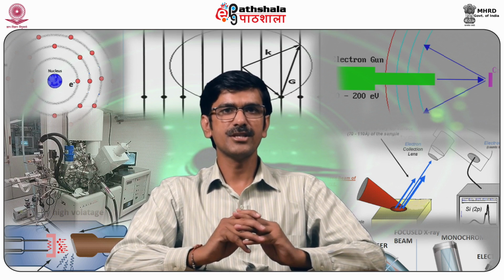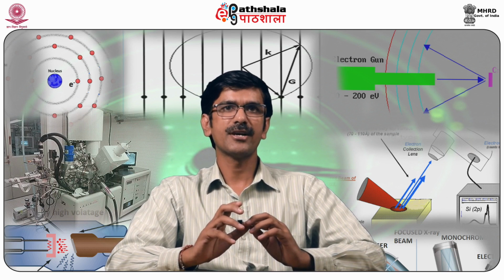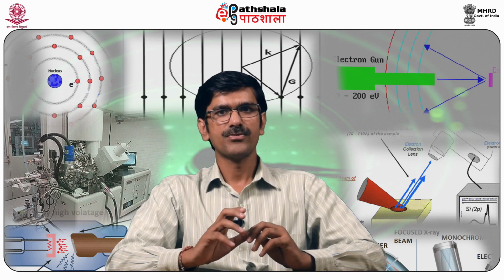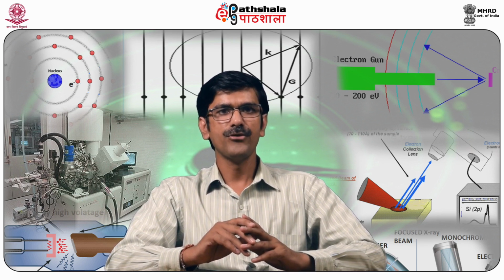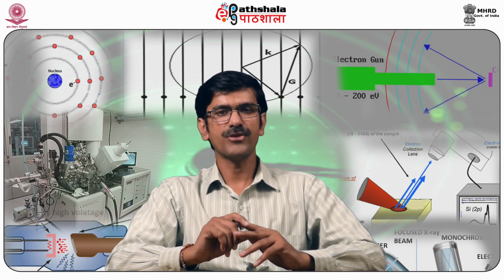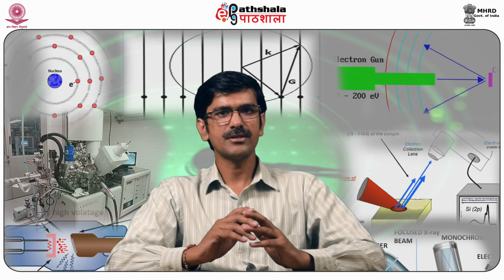If the sample being studied is irradiated by monochromatic light, for example from a laser, the recorded spectrum of scattered light consists of a strong line of the same frequency as the incident light with weaker lines on either side, shifted from the strong line by frequencies ranging from a few to about 3500 cm inverse. Those lines of frequency less than the exciting line are called Stokes lines, and the others are termed anti-Stokes lines.